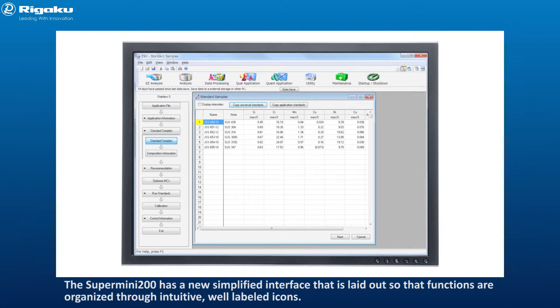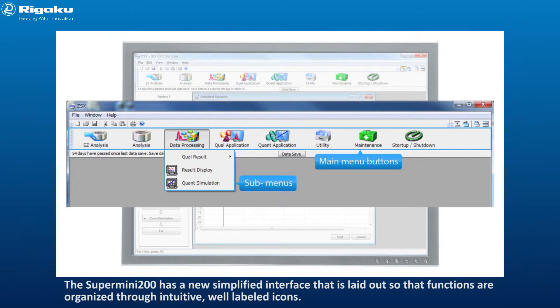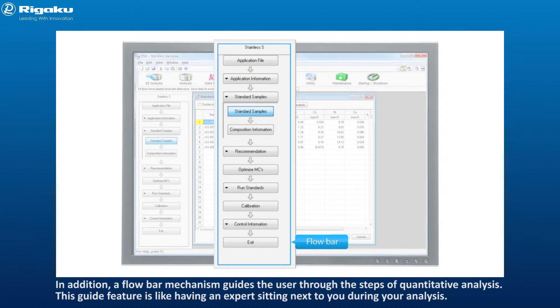The Supermini 200 has a new simplified interface that is laid out so that functions are organized through intuitive, well-labeled icons. In addition, a flow bar mechanism guides the user through the steps of quantitative analysis. This guide feature is like having an expert sitting next to you during your analysis.